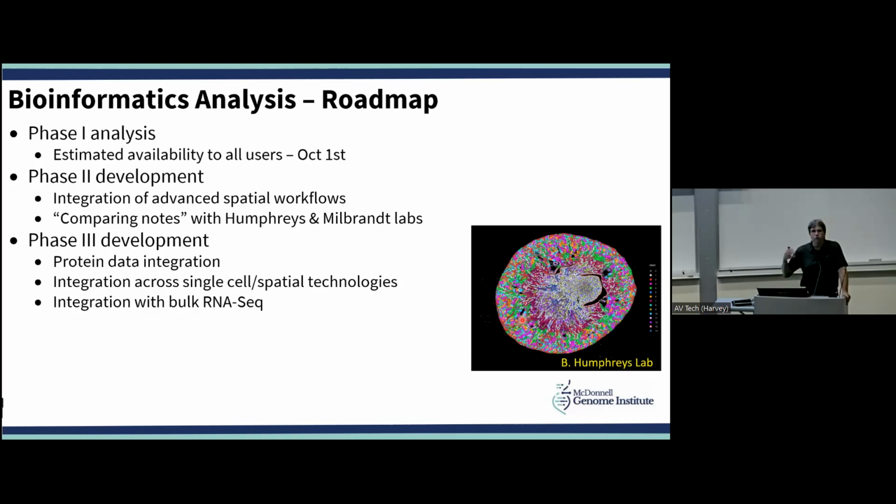And so we want to try to make it so that you can, I saw somebody had a picture the other day of a milkshake with bulk versus these individual components for single cell and spatial, which is true, but with the bulk, you can actually get more about what ingredients are there. So we're going to be doing some work to try to integrate those two things more directly so that we can actually make projections about what's going on in the bulk data.